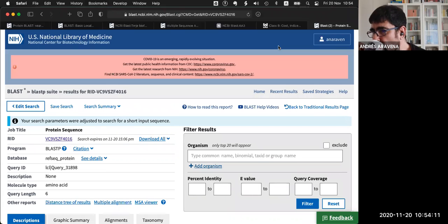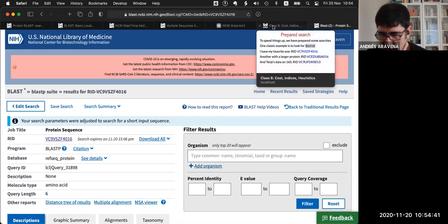Okay. In other words, we are not going to do the search today, mainly because doing the search takes, I don't know, 5 minutes, 10 minutes, 20 minutes, and I don't want to wait for that search to happen in order to explain. So I did the search yesterday, and the results are valid today, but probably not tomorrow, okay? So yeah, okay, let's see. Then, what is the other thing?